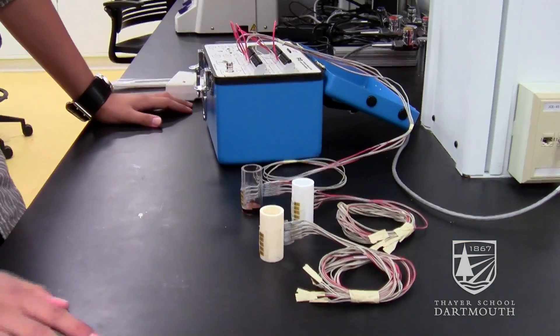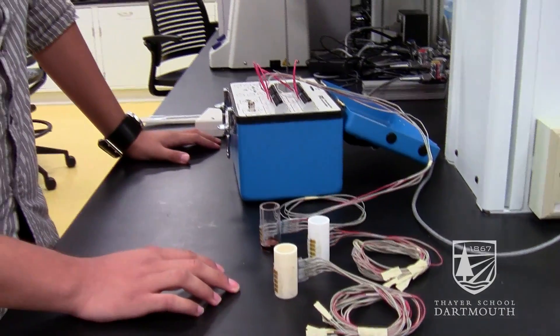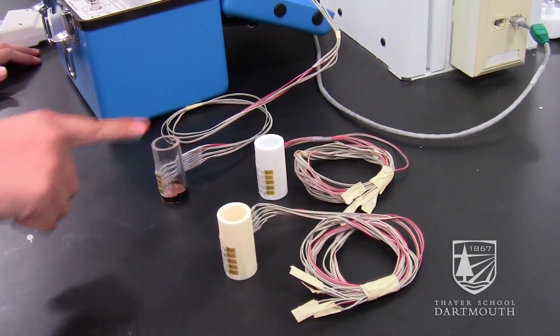My project uses three different mold materials so we can compare and contrast what happens depending on the type of mold we use: an aluminum mold, a teflon mold, and an acrylic mold.